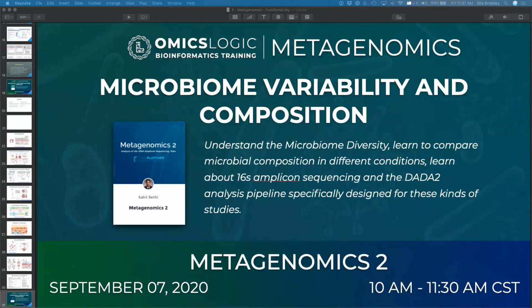From BioProject, how many samples can we select for analysis? So please do it under 10. I suggest to keep it simple in the beginning. So let's have 2 groups, at least 3, but not more than 5 per group.